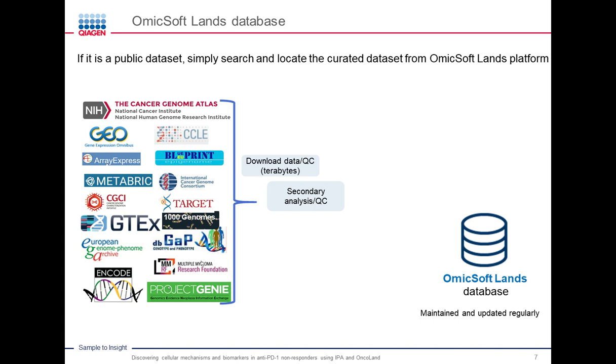reference, and you'll be QCing how many reads are mapped versus how many reads are not mapped. And then finally, you will quantify gene and transcript expression, and then calculate differential expression between groups of your interest. You might be comparing non-responder versus responders, which is what we are going to do, or you might be comparing disease versus normal, treatment 1 versus treatment 2.